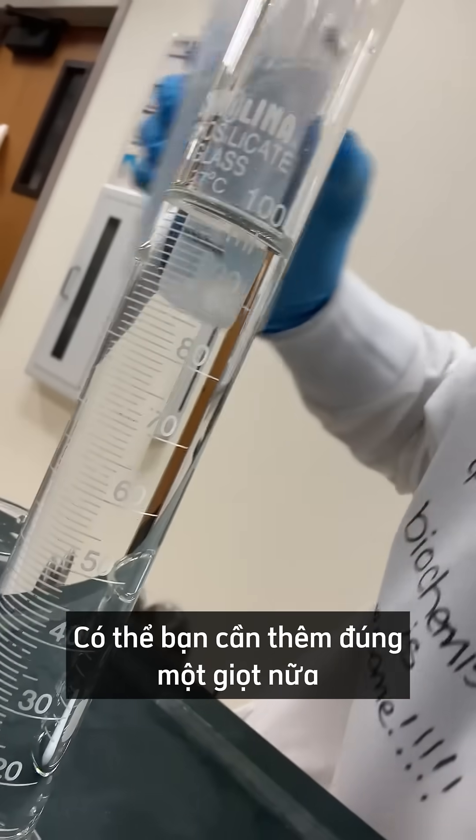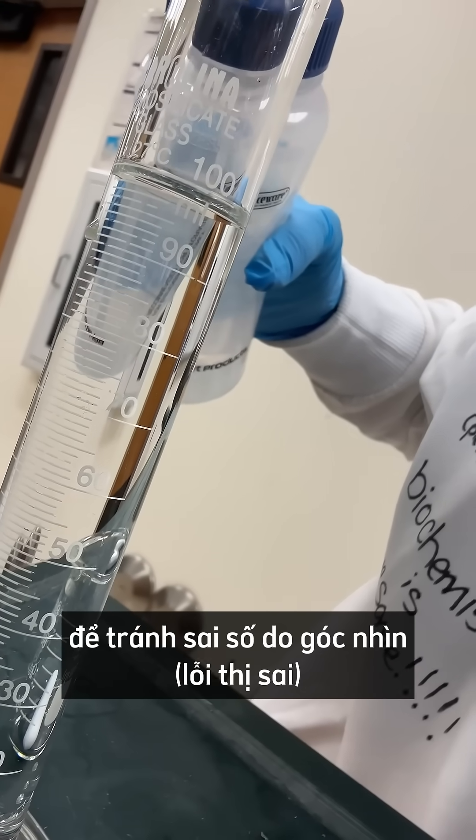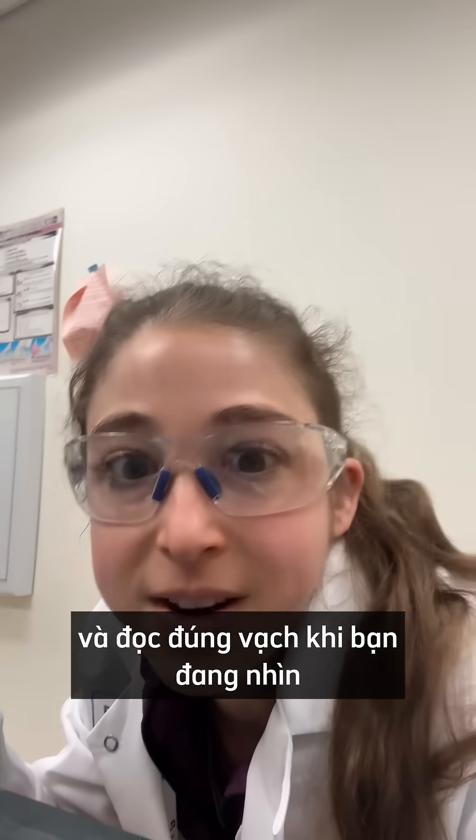Maybe you need one more drop to get the meniscus, but it's just kind of an eye level thing. Avoid that parallax error and read the line right when you're at eye level.